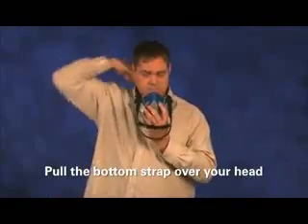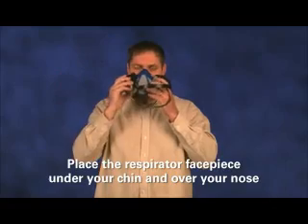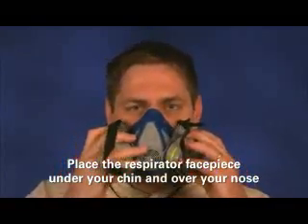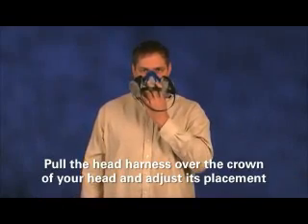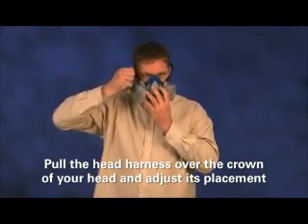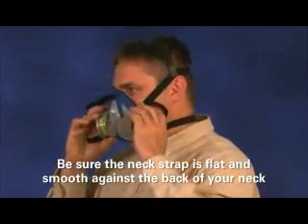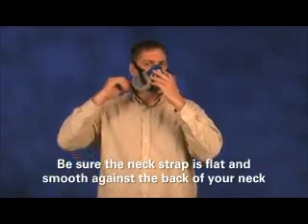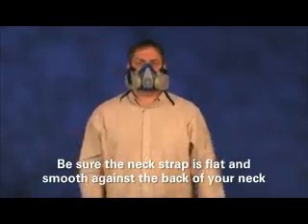Then pull the bottom strap over your head. Place the respirator facepiece under your chin and over your nose, with the narrow part of the facepiece over your nose. Pull the head harness over the crown of your head and adjust its placement until it is stable but comfortable. Be sure that the neck strap is flat and smooth against the back of your neck. Adjust the neck strap, but be careful not to over-tighten the respirator to your face.